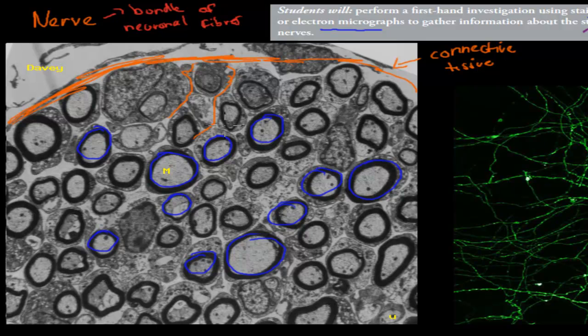We've also got blood vessels as well, which are tiny capillaries which will try to reach every single neuron, because neurons are a cell. Remember, cells need ATP, so they need to bring in oxygen and glucose, and they need to remove carbon dioxide. So we've got blood supply inside our nerves, and we have this connective tissue, which is also important. The vast majority is these neurons, which you can quite clearly see.